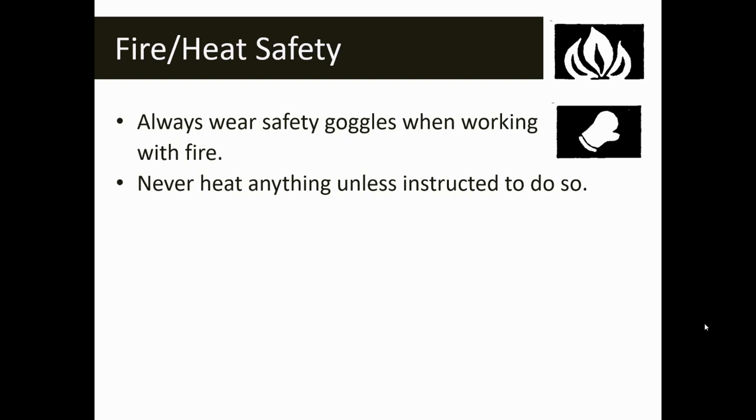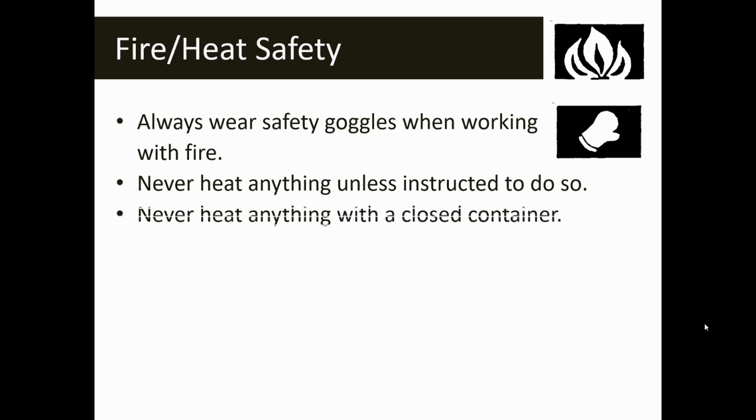Don't heat anything unless you're instructed to do so. Each time you have a lab, your teacher will provide you with both written and oral instructions, so make sure you take the time to listen and read. Unless something is specifically outlined for you to heat, just make sure that you don't do that. Never heat anything in a closed container — pressure could build up inside something confined and that could create a problem.